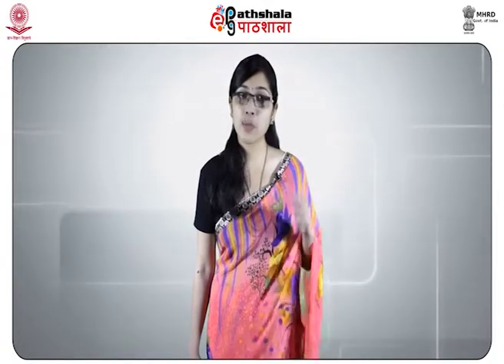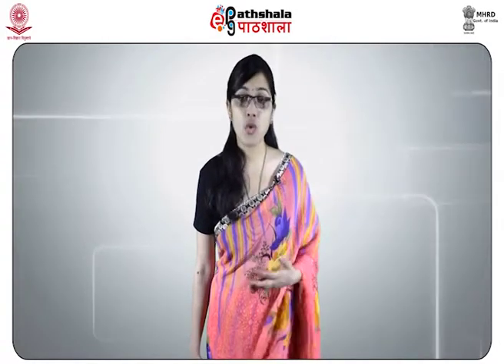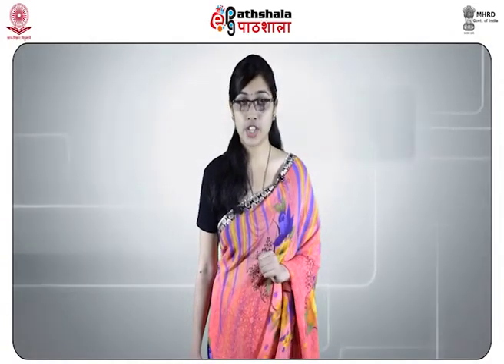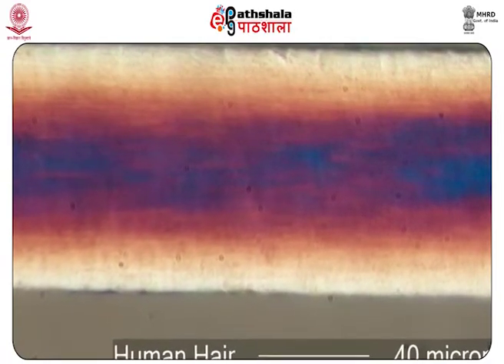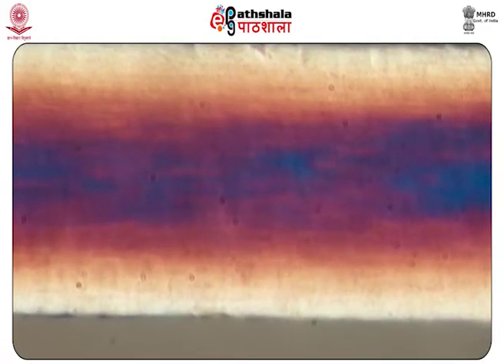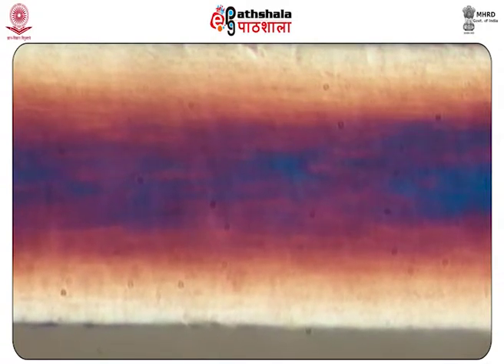The microscopic examination is conducted to analyze whether two or more individuals came in contact, or a person came in contact with an object. The value of hair evidence is related to the variability of hair characteristics between individuals and populations, which can be visualized through the use of the comparison microscope.